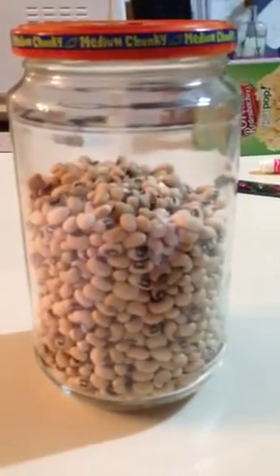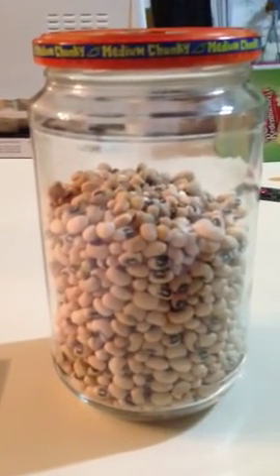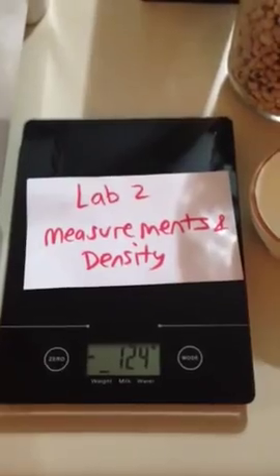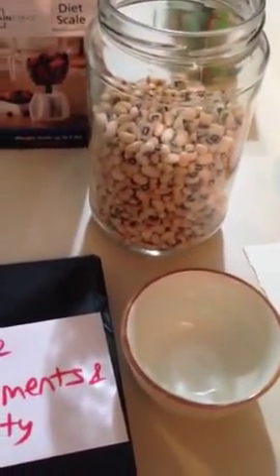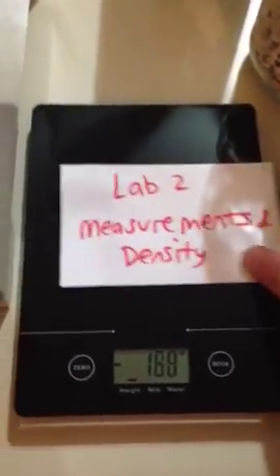So the example that I'm going to do is black-eyed peas, and I know that I can find that on the web resource that I gave you on Blackboard. There's a link under the supplementary videos that you can click on to look up food densities. So you may want to check there and make sure the food is listed online before. Now once you've selected a food that is on the list that I gave you the web resource for, we can start by measuring the mass and the volume, which are the two things that we need to find density.